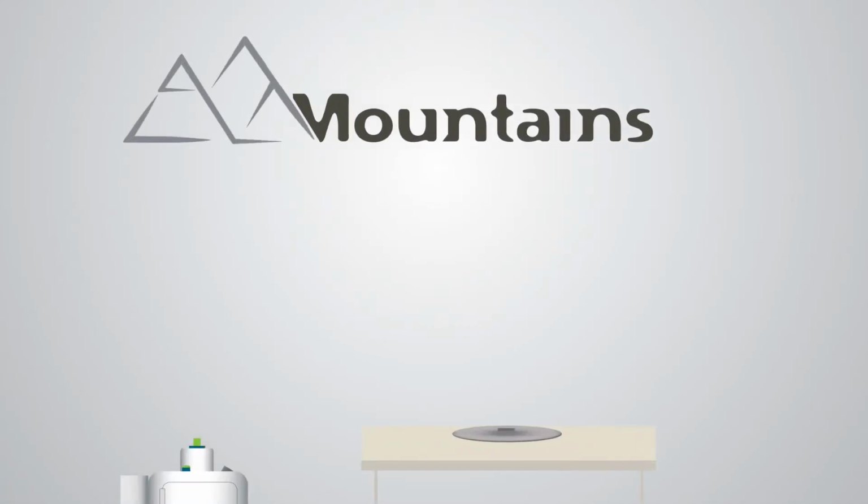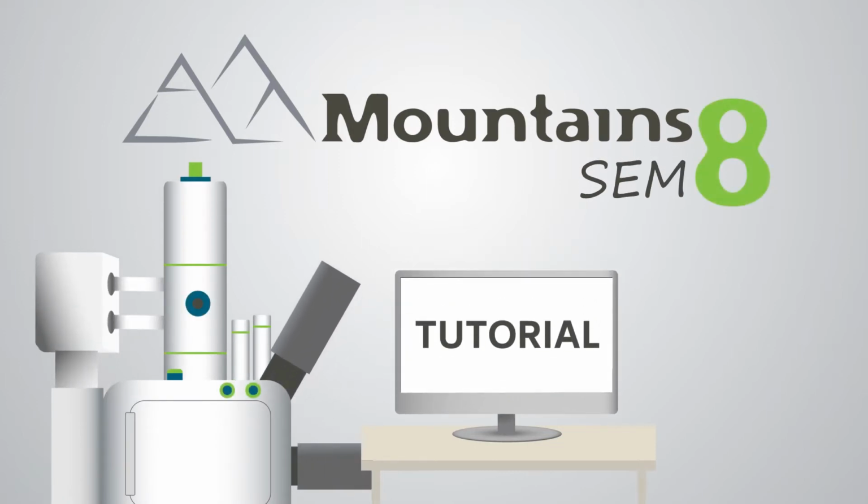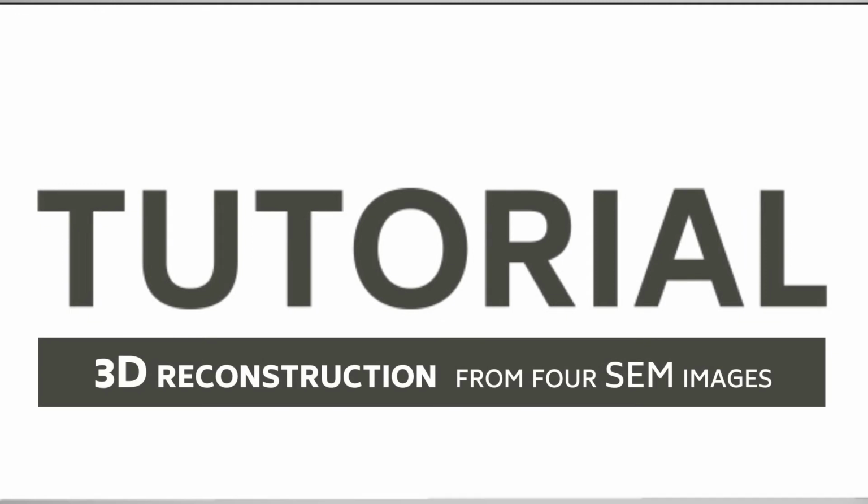Hello, and welcome to this video tutorial on Mountains SEM, Digital Surf's industry standard software for scanning electron microscope image analysis. Today, I'm going to show you how to reconstruct a 3D model from 4 images obtained from an SEM.